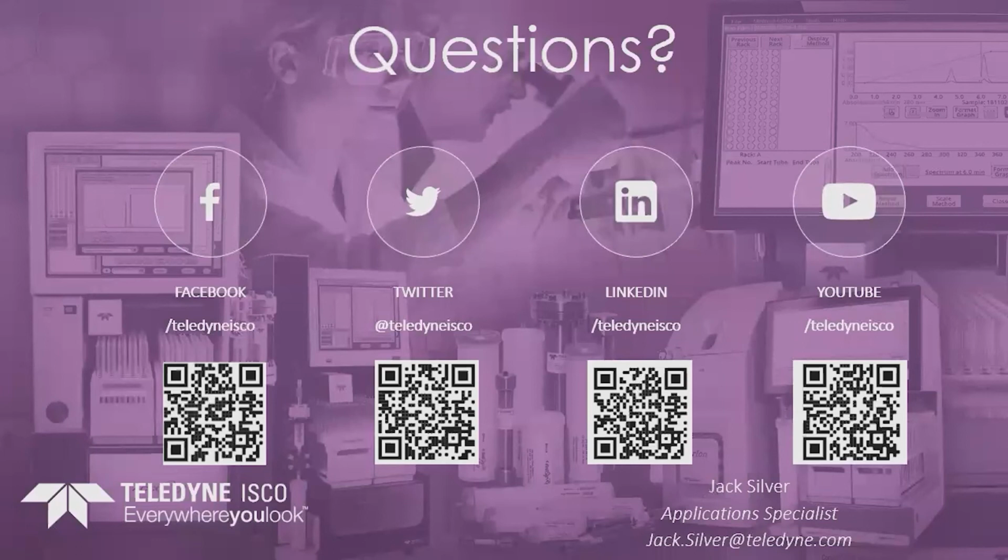The next question is, if you see the solvent front on the 254 nanometers, can that be an additive, or is that your material? It's hard to say. The solvent front on the 254 nanometers might be a solvent impurity that runs up at the top. It could be your spot that's spread out, although your spot should still show up as a spot.